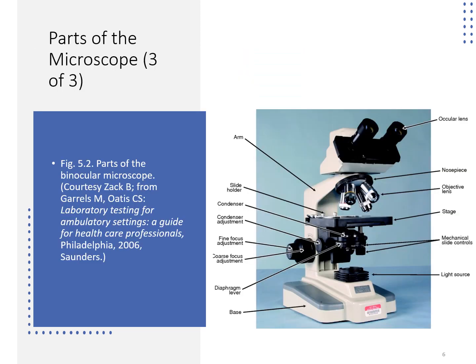You will use a microscope a lot throughout your studies in the medical laboratory field and throughout your career, so you should become very familiar with the microscope itself and its various components and parts. You will be responsible for cleaning and caring for the microscopes, so you will need to learn how to properly use them, and which components you may clean and what is acceptable to clean them with.